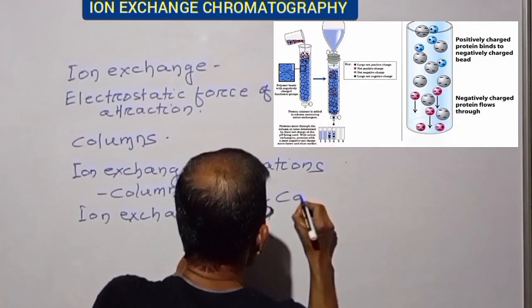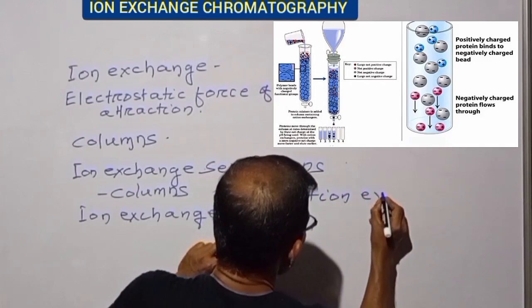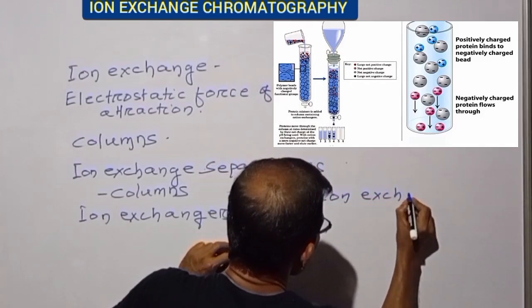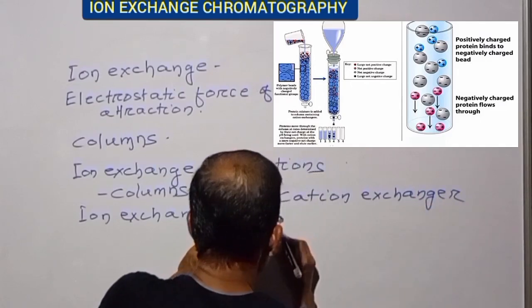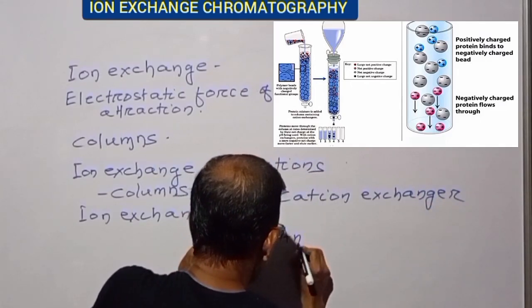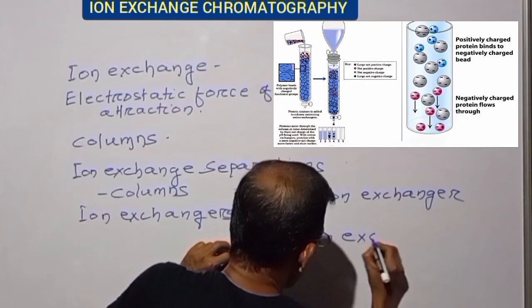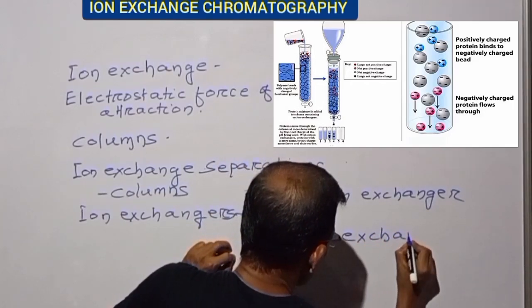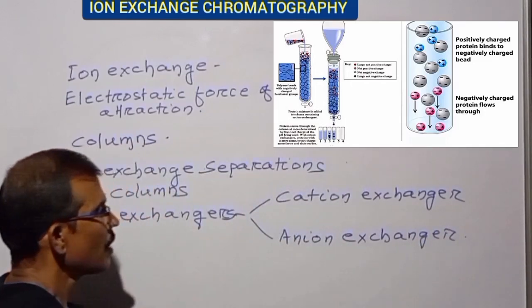One is cation exchanger and the other is anion exchanger.